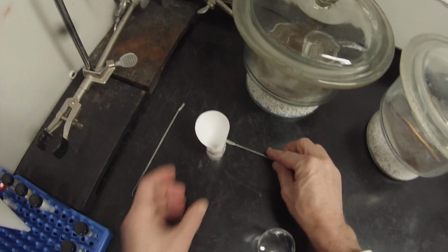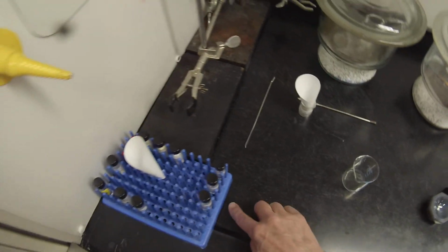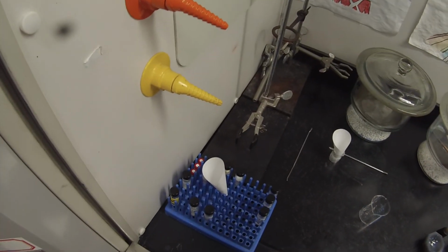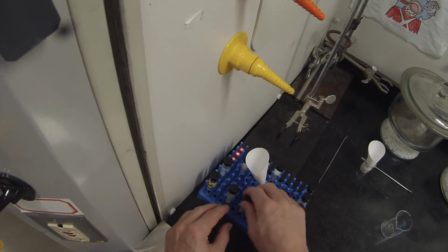So there's a little bit of solid in there. Maybe I can use that for the melting point. Tap that in. And that's plenty of solid to be set aside for later use. So we'll sit that one there. This beaker can go back.